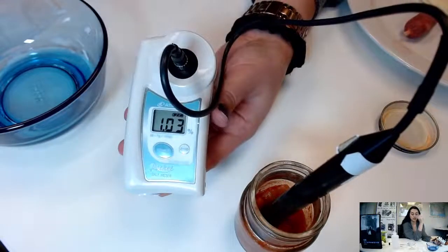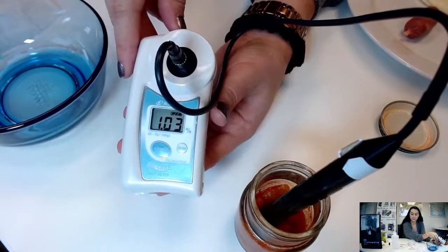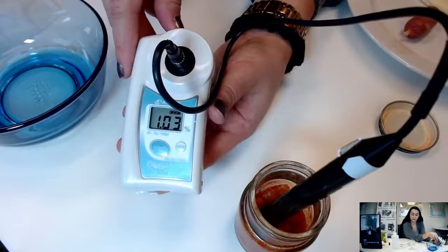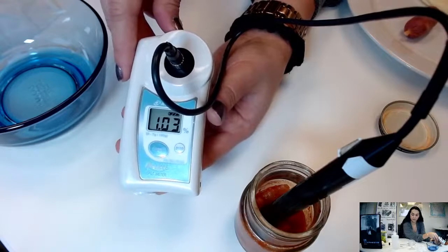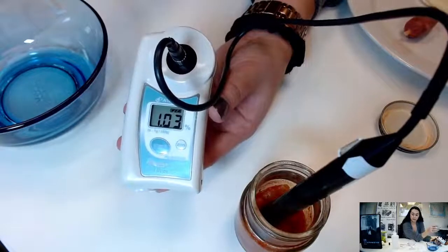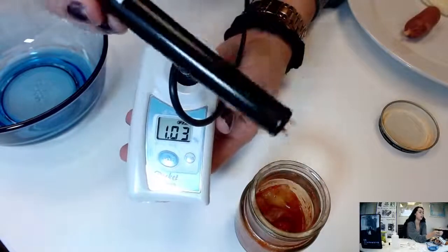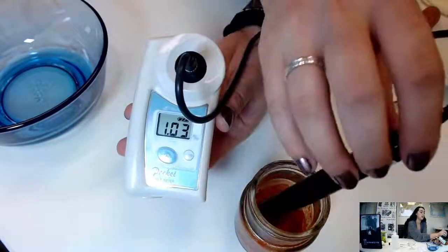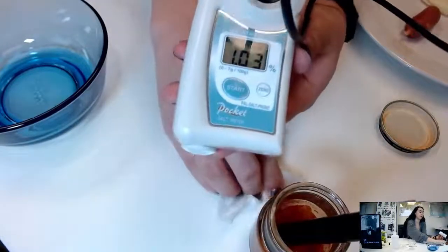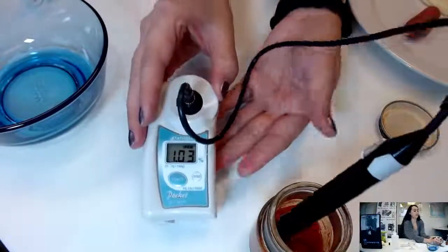For repair and warranty for this unit, the Palisalt probe is warranted for 1 year after the date of purchase against any manufacturer defect in material or workmanship. Since the Palisalt probe is a precise electrode electronic instrument, please take care when using it. If you drop the unit, that is not considered under warranty because it is a user issue, but it is under warranty for 1 year. You can also register this unit as well.